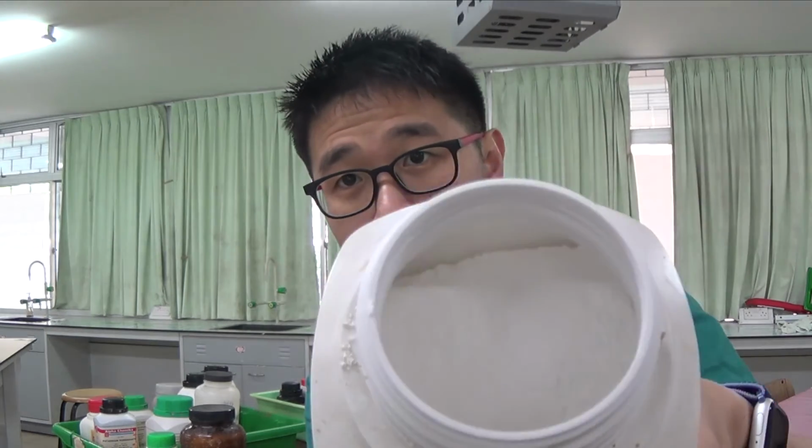What I'm not sure, however, is the ratio of how much zinc carbonate there is to zinc hydroxide, because it's a mixture, right? A mixture is not a compound, and since it is not a compound, the things that you are mixing together do not need to be in a fixed ratio, whereas a compound consists of two or more elements combined chemically in a fixed ratio. Like when you have H2O, water, steam, ice, the hydrogen to oxygen is a 2:1 ratio. 2 hydrogen to 1 oxygen. Every time you have water or ice or steam, you must have a 2:1 ratio, unlike a mixture. So this is also a white solid.